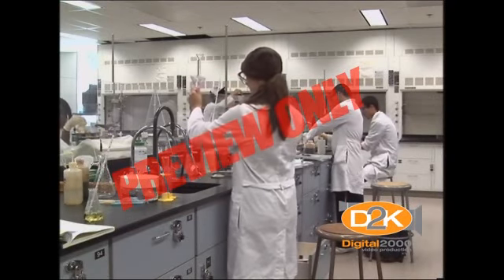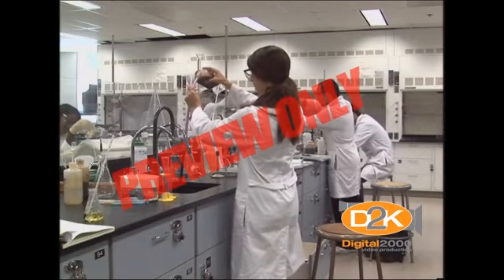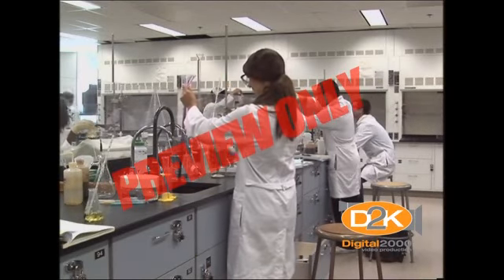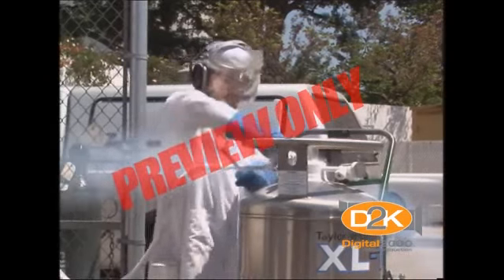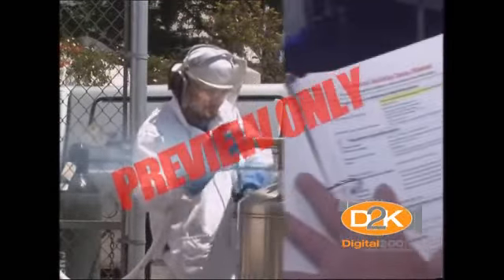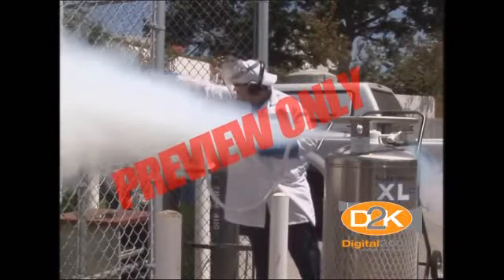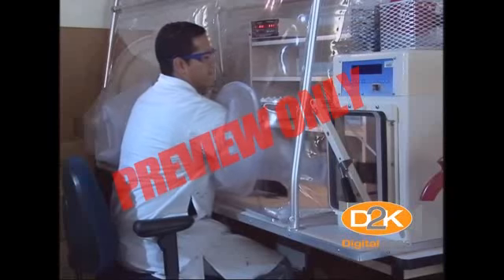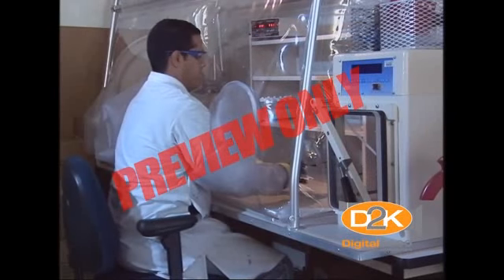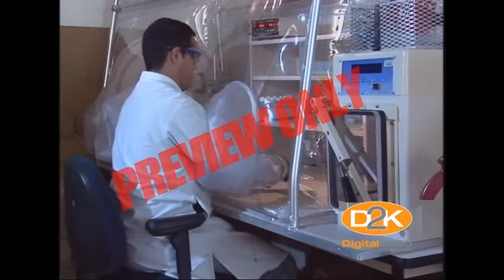Loose sleeves, dangling jewelry, clothing that leaves the legs exposed, or shoes with heels greater than 1 inch should never be worn in the laboratory. In some instances, additional protection may be necessary. Material safety data sheets, commonly referred to as the MSDS, will provide specific PPE recommendations for handling chemicals. Personal protective equipment should be durable, designed to provide adequate protection, and capable of preventing exposure to hazardous substances.